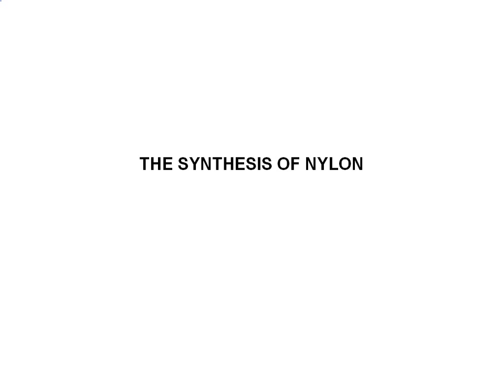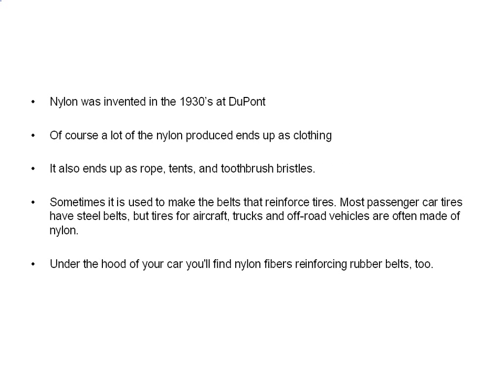Hi everyone, this week's lab is on the synthesis of nylon. Nylon was invented back in the early 30s at DuPont. Of course, we know a lot of nylon winds up in clothes. It's also used in rope, tents, and toothbrushes.